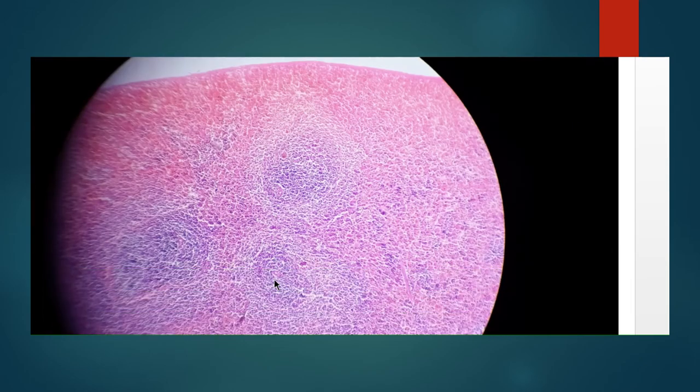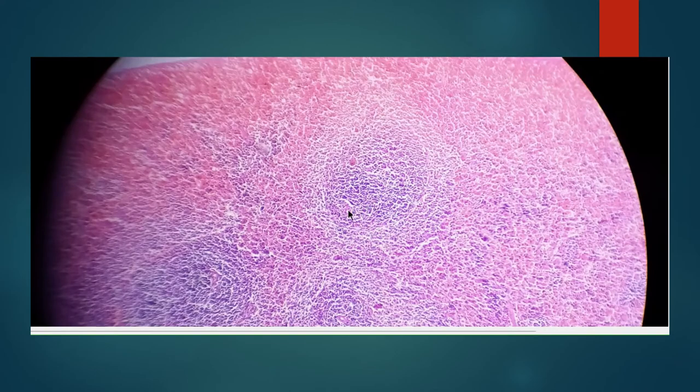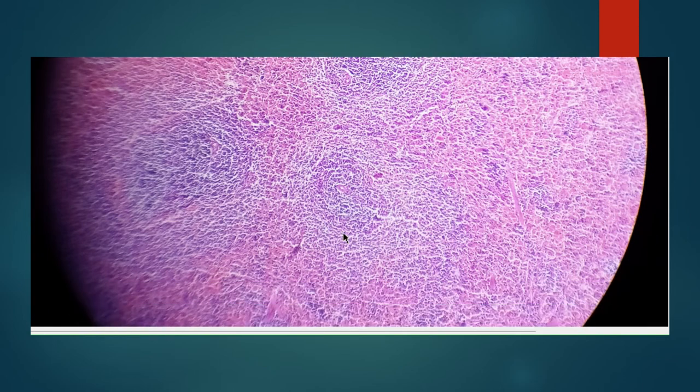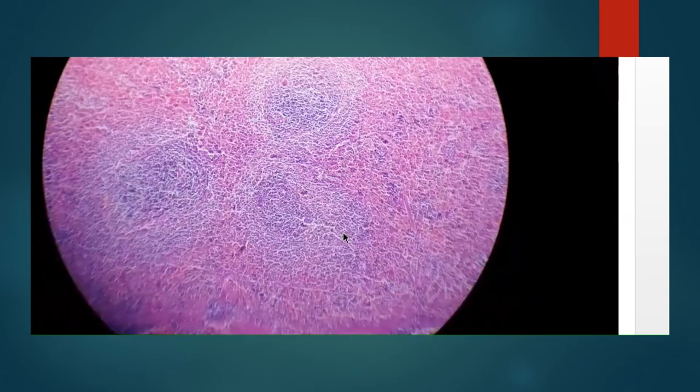Next thing, here also you can identify the spleen, same spleen slide. Identify the splenic central artery. So this is the better photograph. The central artery which is placed eccentrically. So eccentrically placed central artery, white pulp and the red pulp. That is our identification point of the spleen. There's also the spleen. Try to identify the central artery which is placed eccentrically.